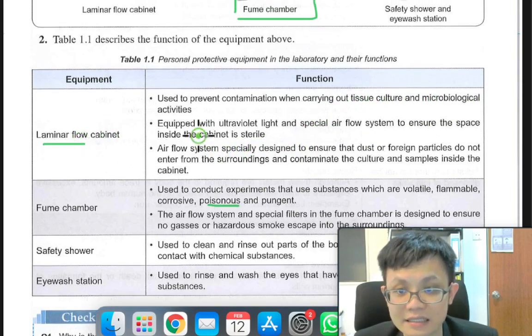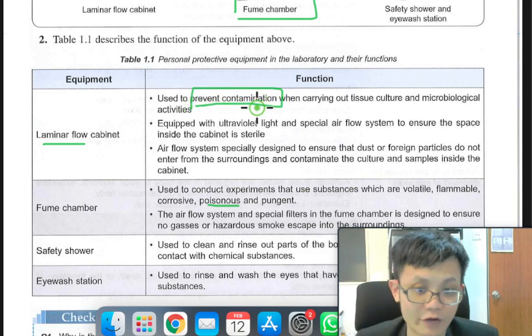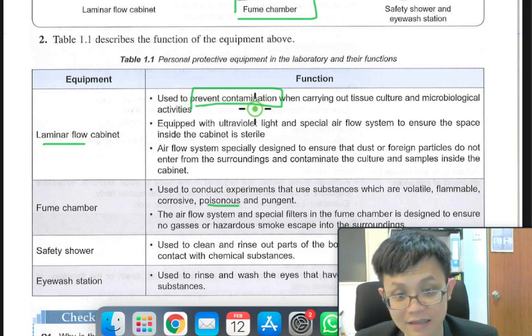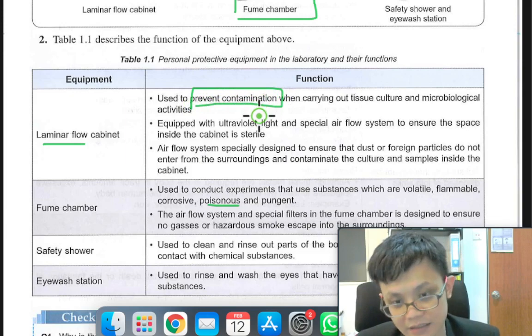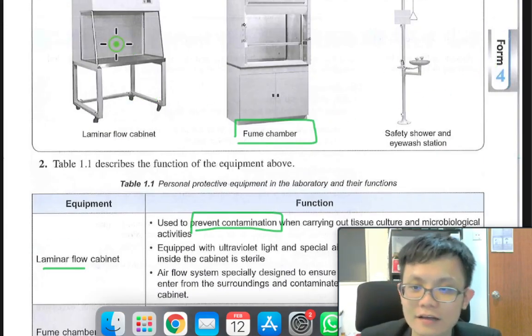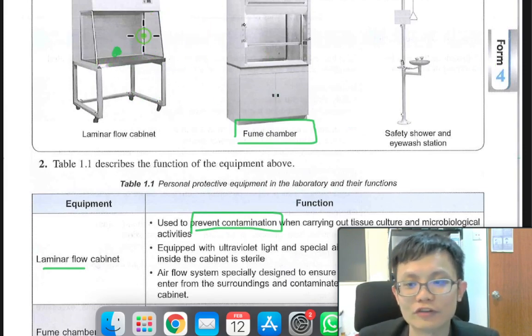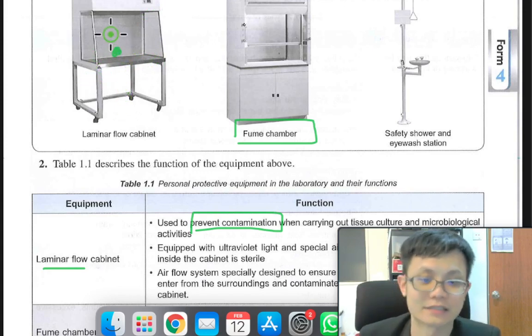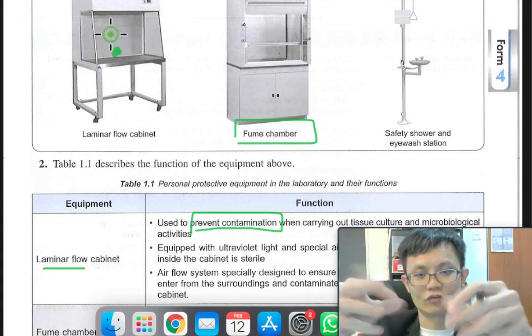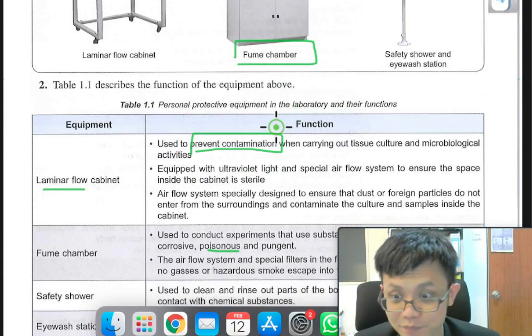Make sure it prevents contamination. It means it must be very clean. Let's say you watch a movie where you want to work on the zombie virus, so you put it inside, and you put your hand inside and you work on the zombie virus. You don't want to spread the zombie virus out.